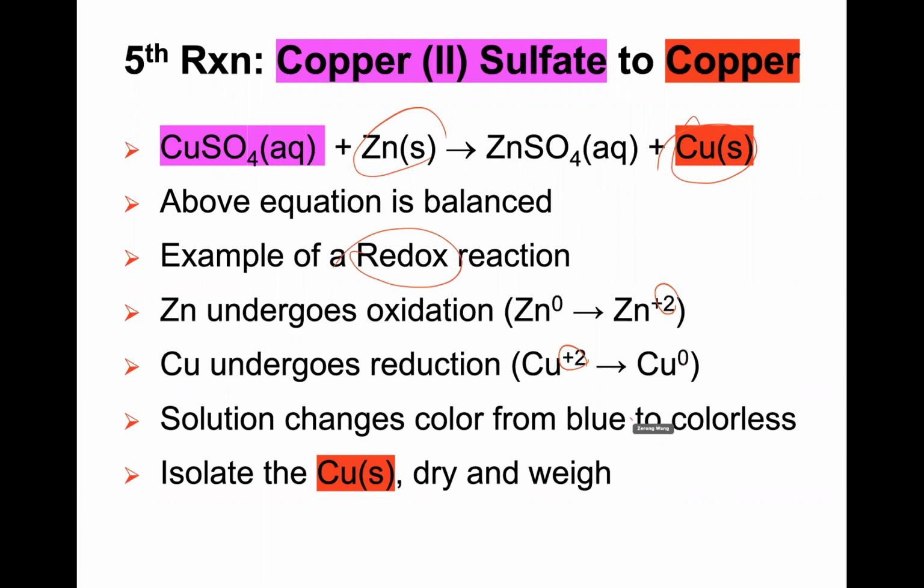Because this one should be blue, and this one should be shiny red, depending on how fast the reaction is. This one is not soluble in water anymore, so we can isolate it and dry it. At this stage, you can compare how much copper you recovered, and based on how much you initially had, you can find the recovery yield.